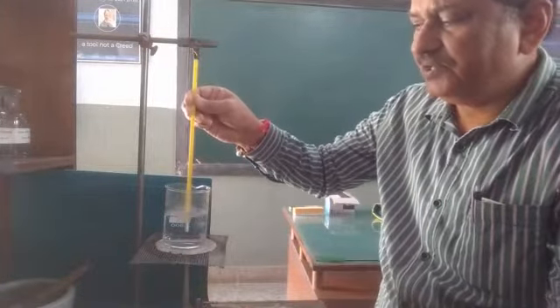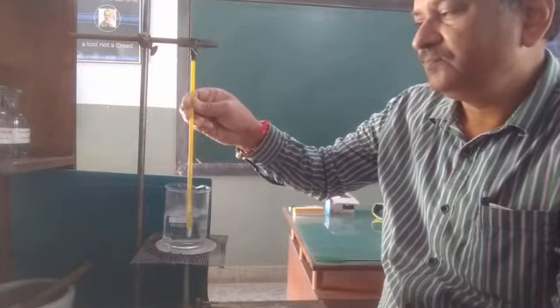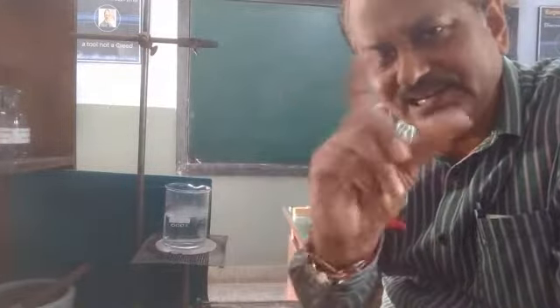And see again, you can see here this temperature, 100 degrees Celsius. So this is about the boiling. So this is for water. For other liquids, we use a slightly different setup. So this is all.